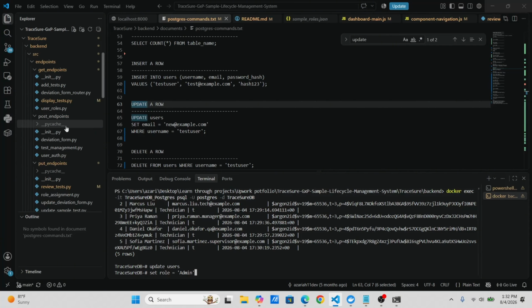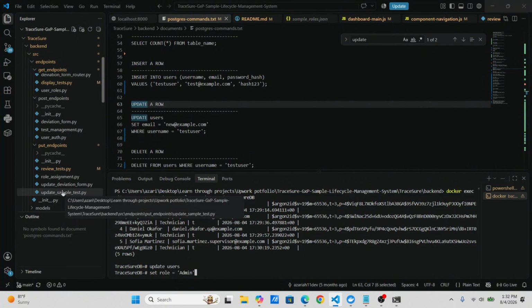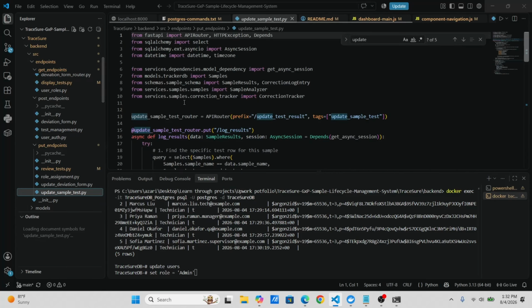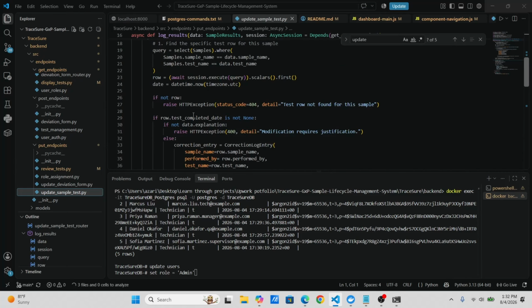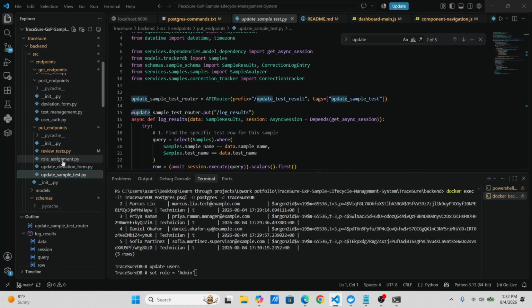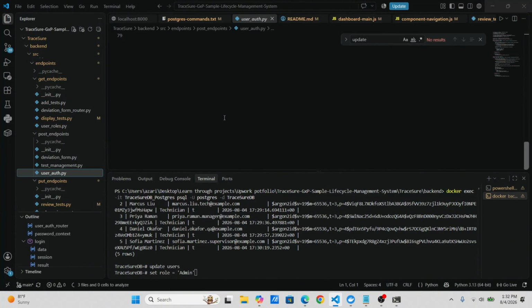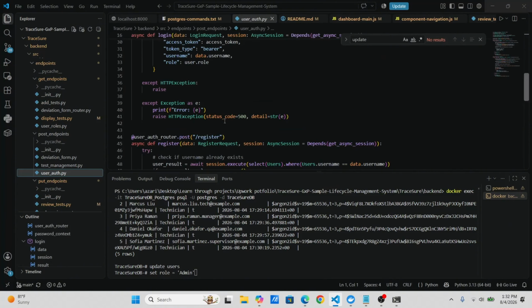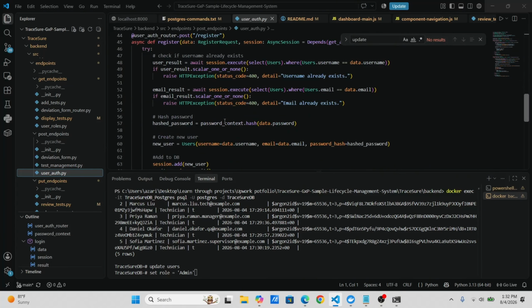I think this is what I initially went with, right? Let me check before I actually do anything. Wait, where did I put this file?